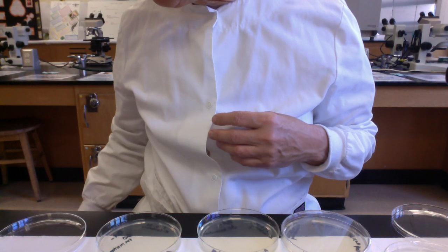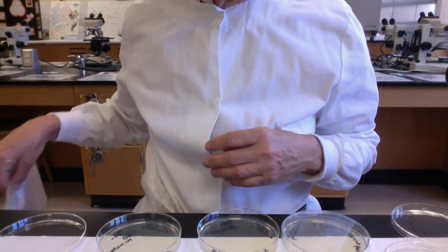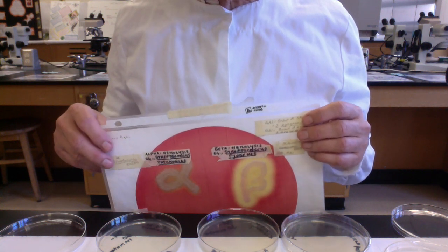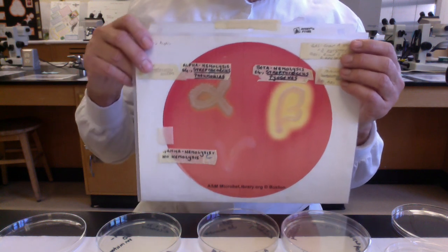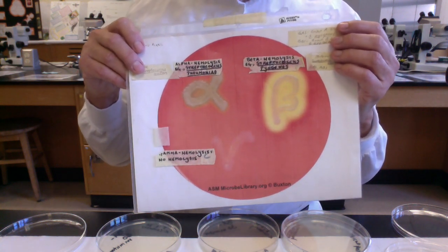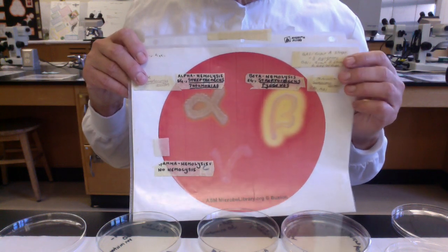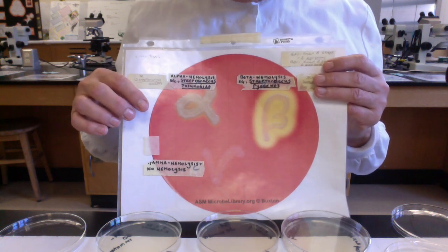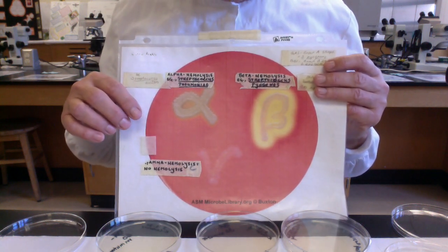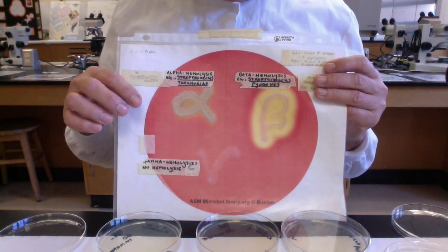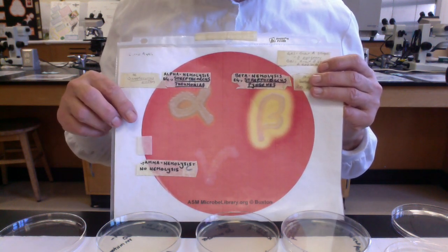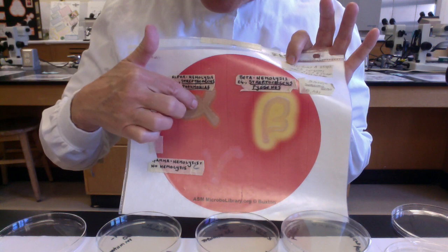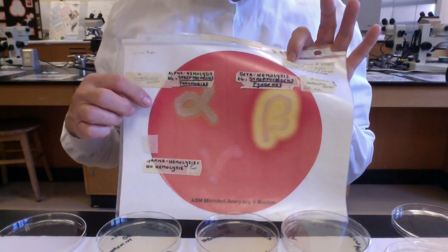So hemolysis is the lysis of red blood cells, and since our blood agar has red blood cells in it, we'll see three different types of hemolysis. And I don't know if this is going to be that great, but we'll see if we can use this. And again folks, we'll do a PowerPoint so we'll have better images on the PowerPoint. So there's three types of hemolysis, and this is a really cool plate that was in the ASM American Society for Microbiology Microbe Library. And what they did, this is a blood plate, and they've taken three different types of bacteria and they've inoculated the bacteria using the Greek alphabet for the type of hemolysis.